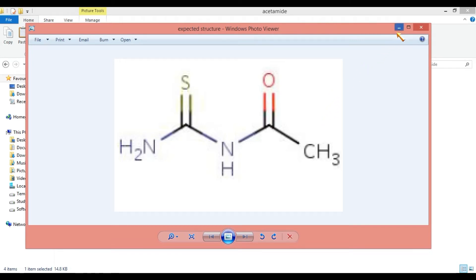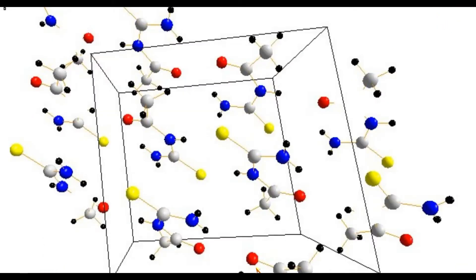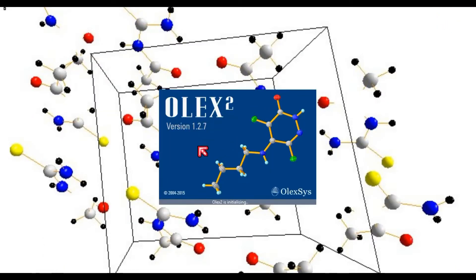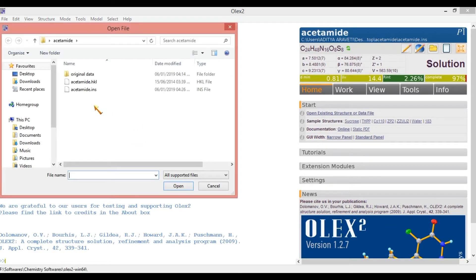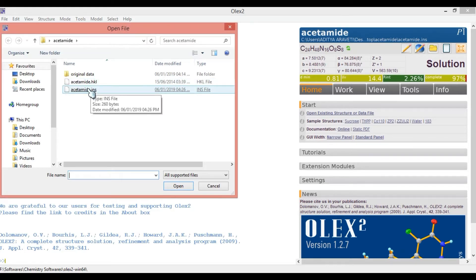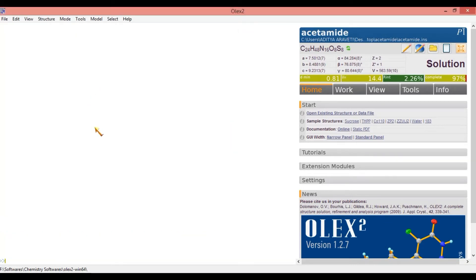Let us see if we can get this structure using OLEX2 software. Now I am opening OLEX2 software. This is the user interface of OLEX2 software. Go to File and open the structure — open the .ins file. We should not open the .hkl file here; we should open only the .ins file. Click on the .ins file and you will get a screen like this.